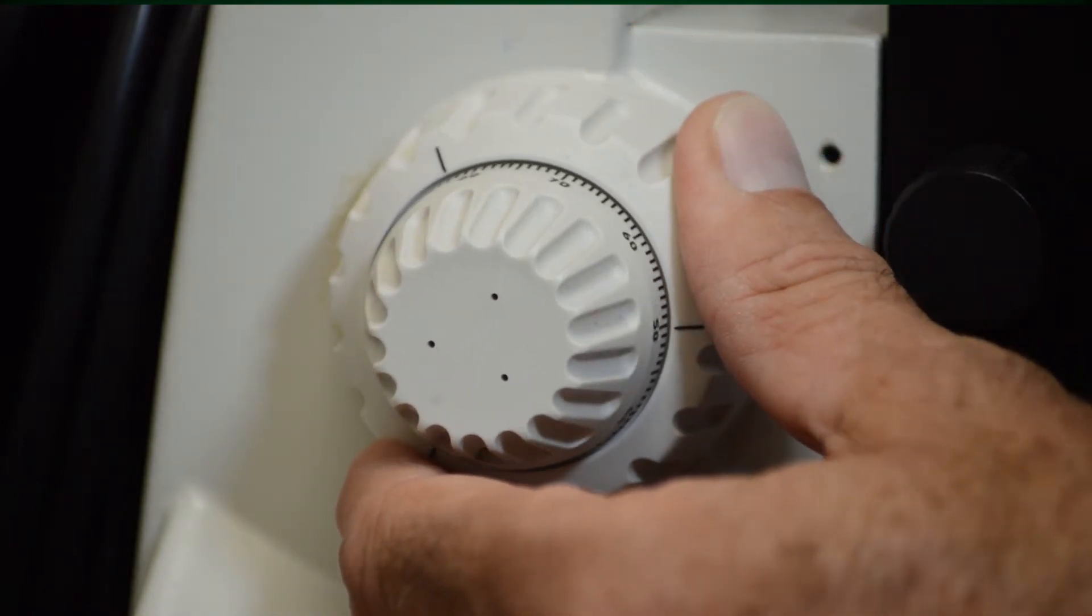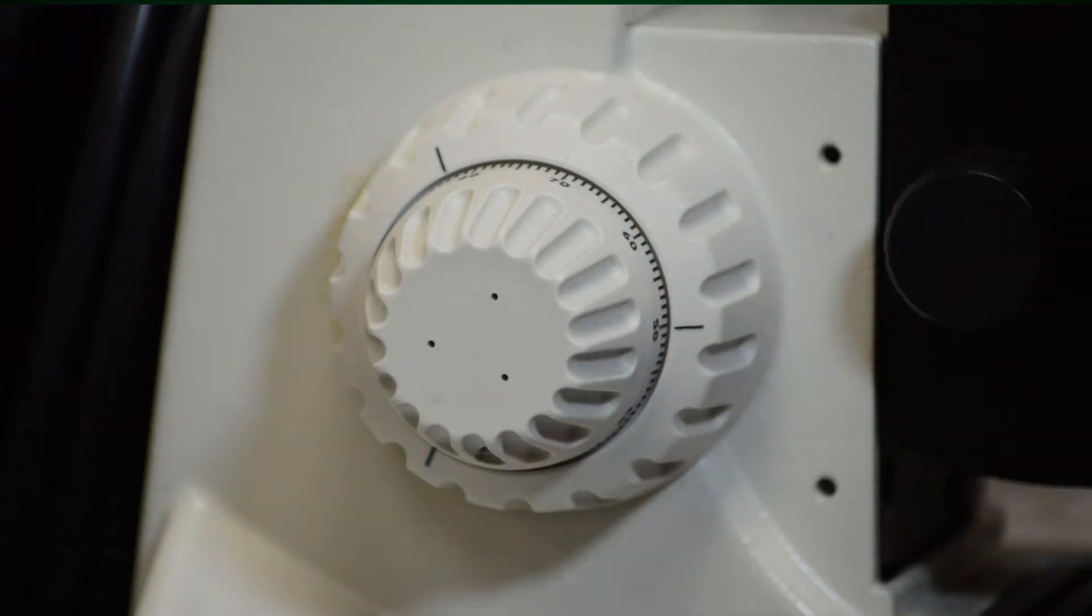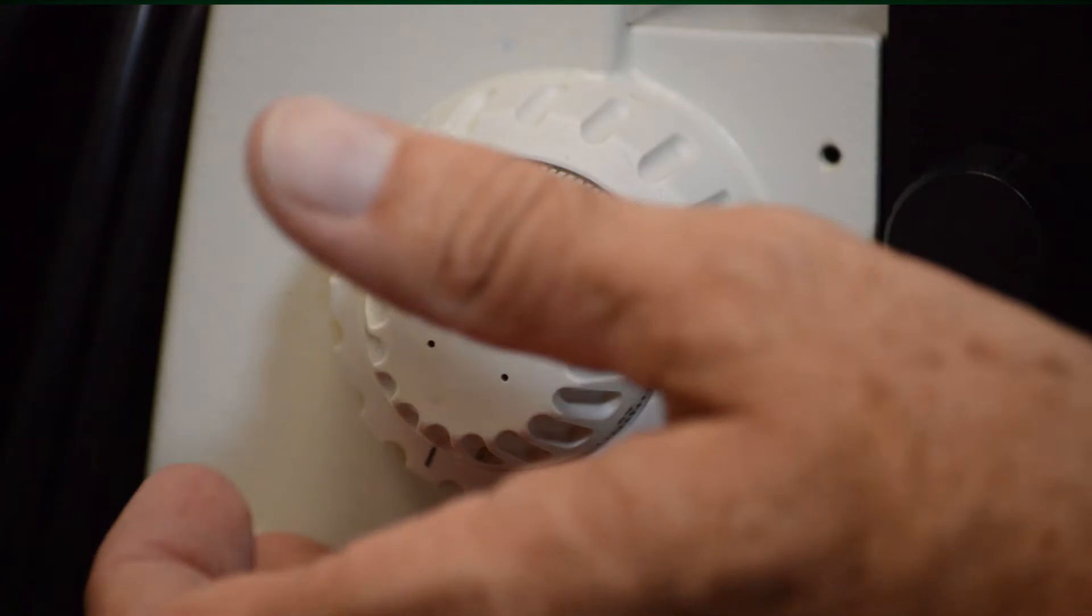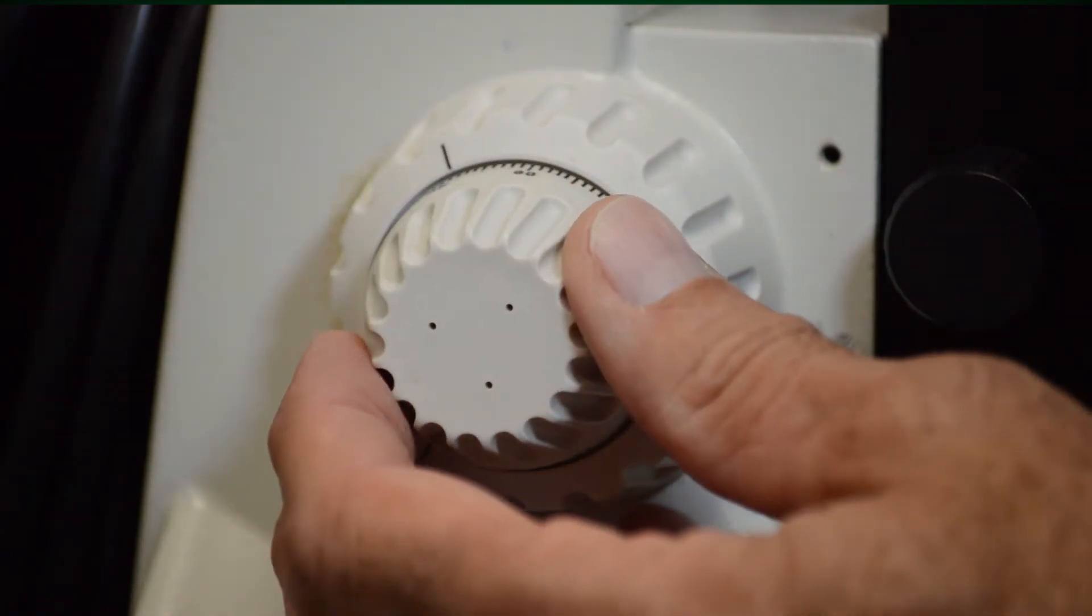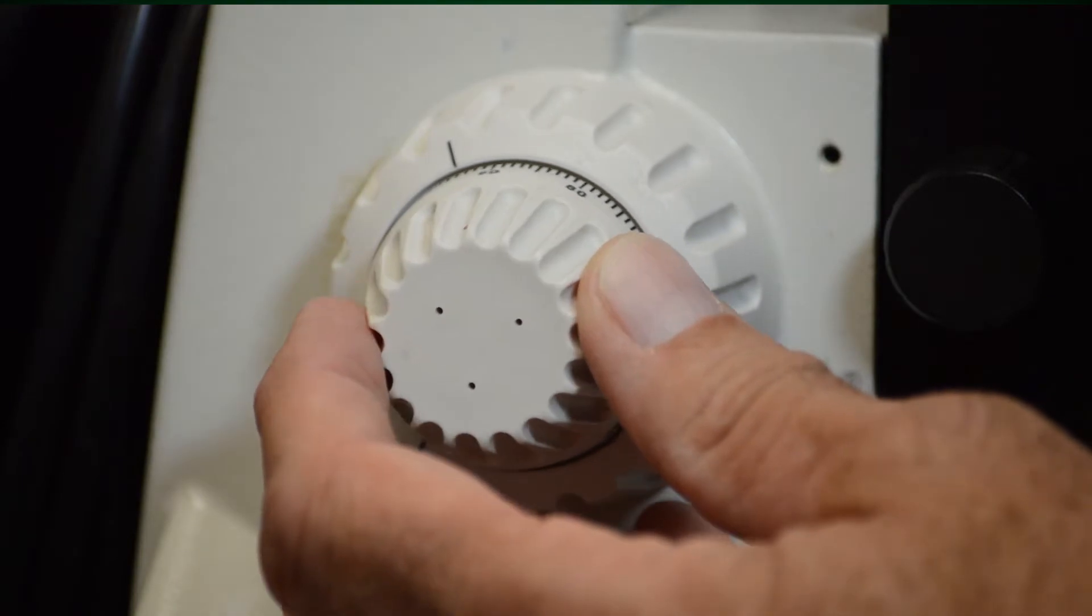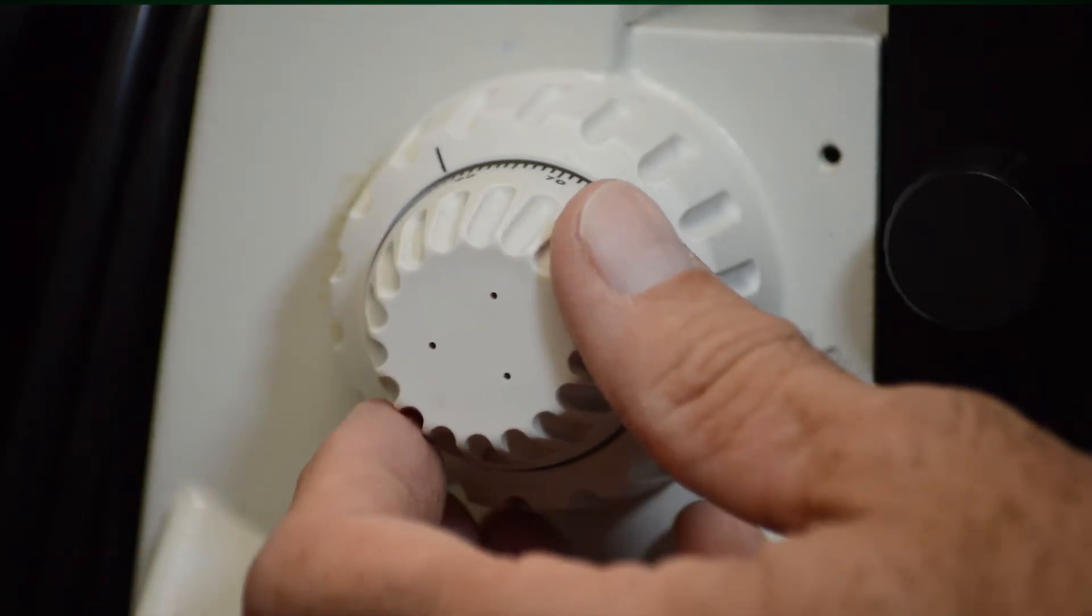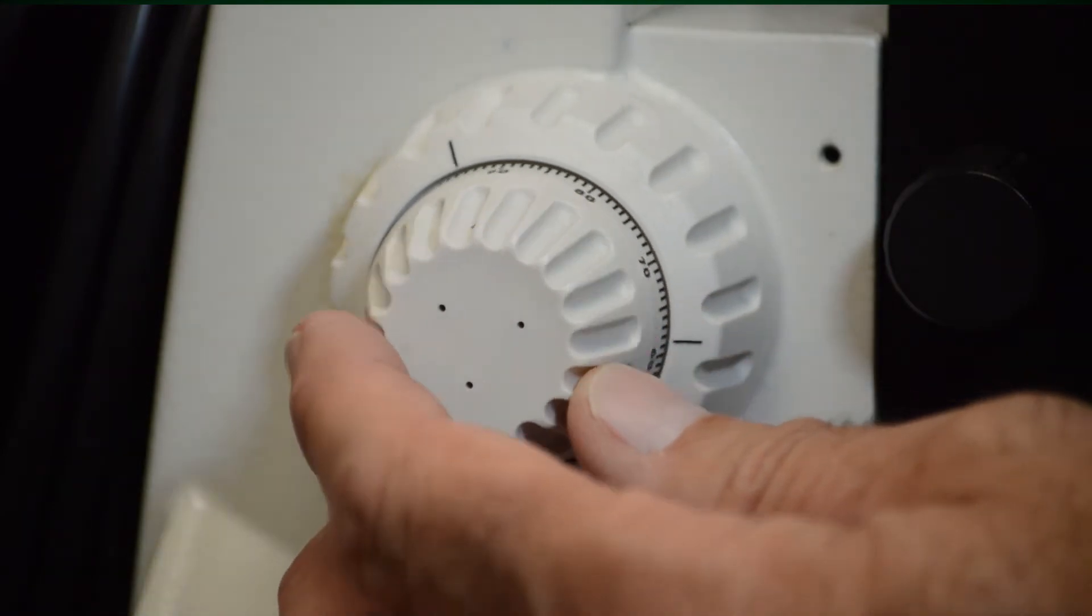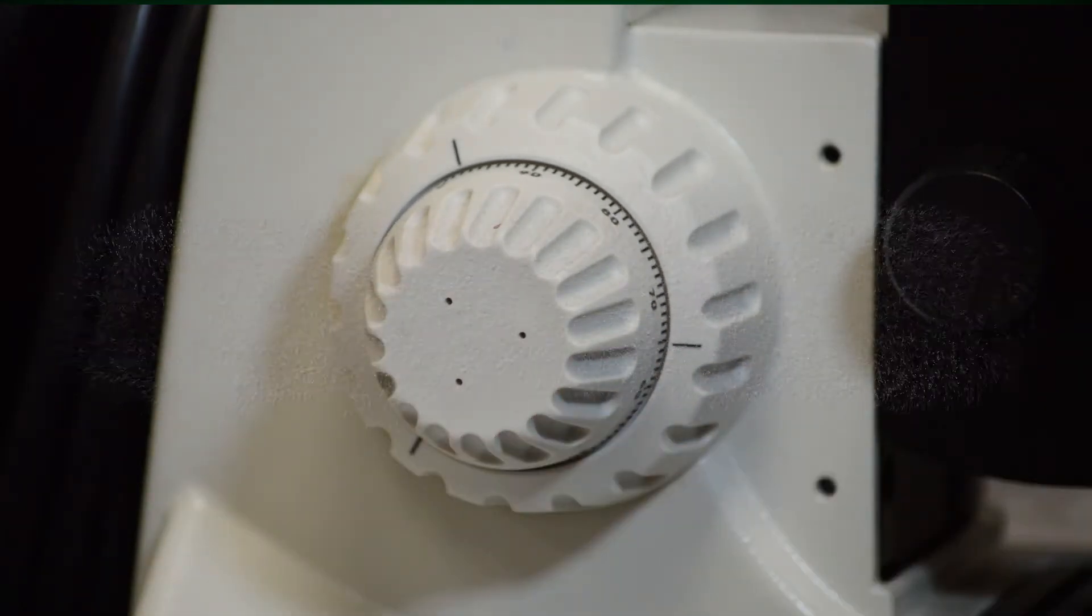The coarse focusing knob is the outer knob. The fine focusing knob is the inner knob. When you turn these do not turn them quickly but rather turn them slowly so that you can actually see where you are going. If you turn them too quickly many times you jump past what you really want to look at.